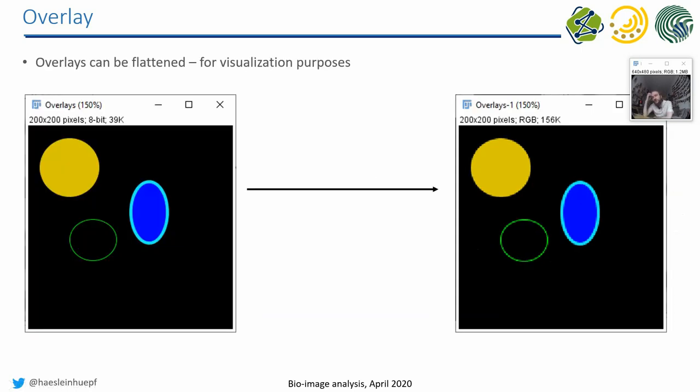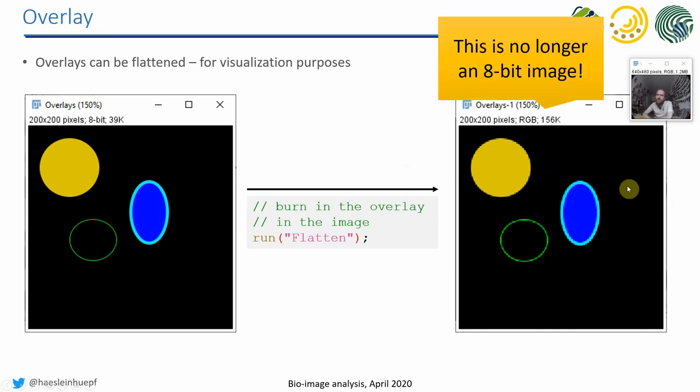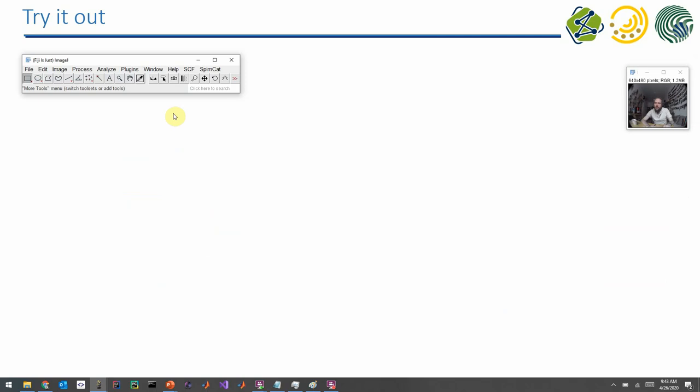And furthermore, if you want to finally put the overlay into the actual image, you have to call the so-called flatten method, which reduces an image with an overlay to an image. And the important point here is that this is no longer an 8-bit image. And it also means that it overwrites pixel values.